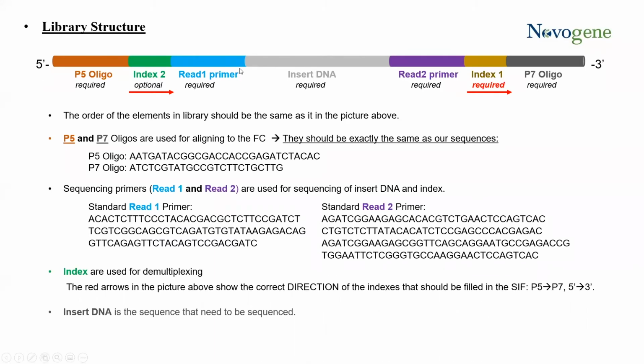So it would extend 150 base pairs in this direction, and on the reverse strand, it would extend 150 base pairs in this direction. Ideally, we would design our insert such that it is not greater than around 400 base pairs. We don't want the reads to overlap each other because then the data isn't as useful.